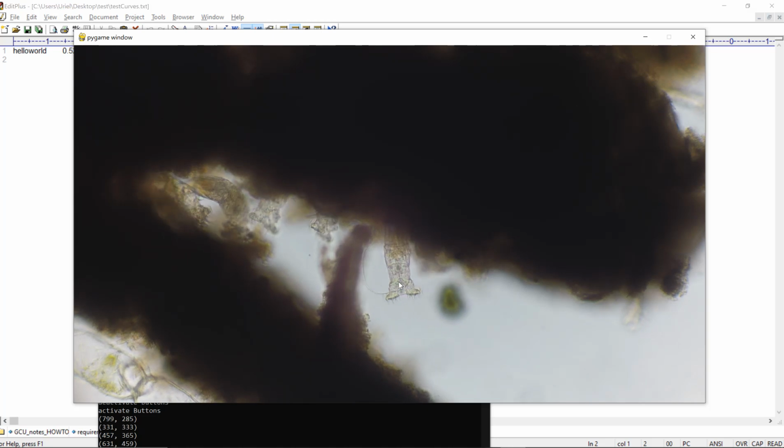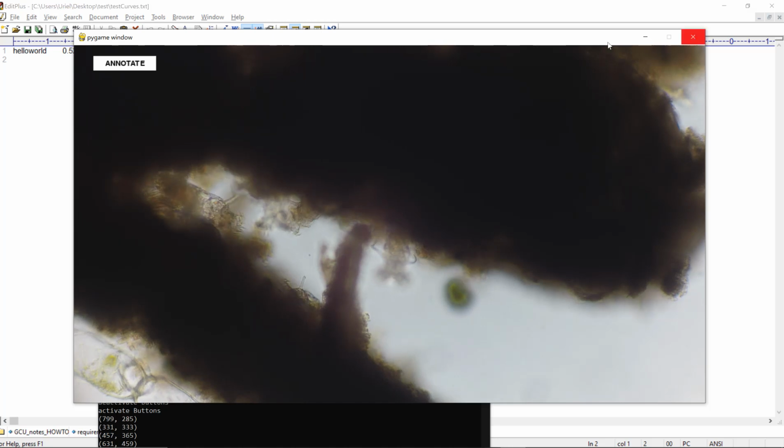This guy is begging for another one. I'm gonna set the box here. It's another rotifer. And it turns out that rotifers are actually quite hard to get because they really like hiding most of their body parts. So sometimes it confuses the model. I'm starting to consider whether or not it may be useful to separate it into two classes: rotifers feeding and rotifers otherwise. I'm gonna press D for done, and then I'm gonna close the program to avoid temptations.